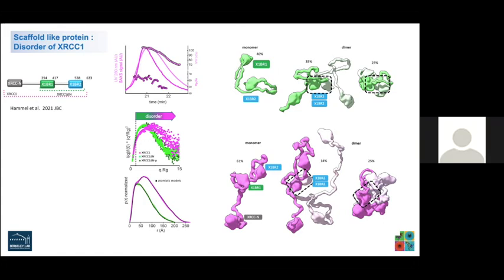Okay, Nicole. Hi, I'm actually at the NIH. We were at Washington University and we've used your system for a long time. We've transitioned to making nanoparticles and VLPs for vaccine development. We've sent some through your SEC-SAXS, but the molecular weight cutoffs for your columns are smaller than some of our nanoparticles. So I was just wondering if you had another way to do it.